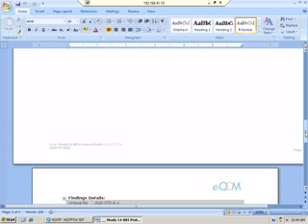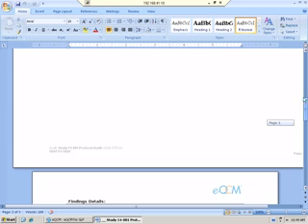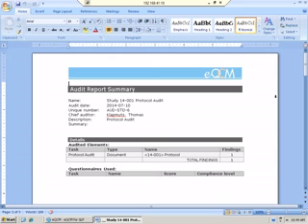And like I said, we're not really in the business of QA auditing, so every company may have a different audit report document that they want to use. This is just showing you that we can link all of the audited items directly into your document. We can do the same thing with protocols or reports, so any metadata maintained in the system can be loaded directly into documents.